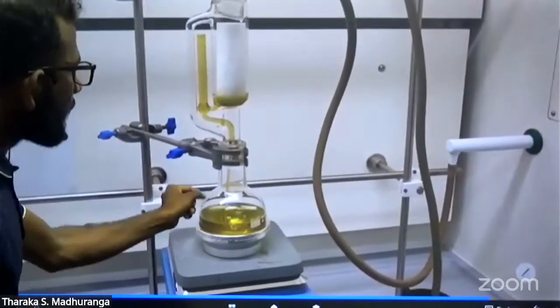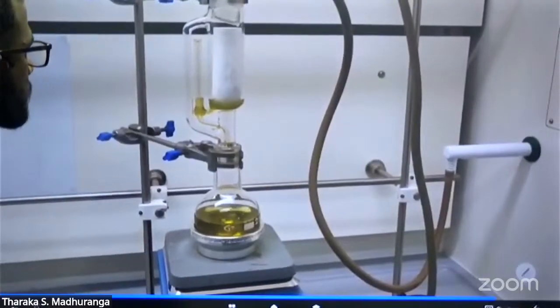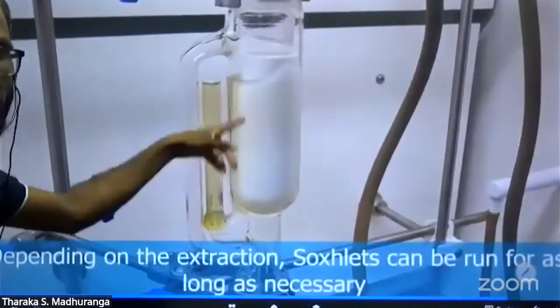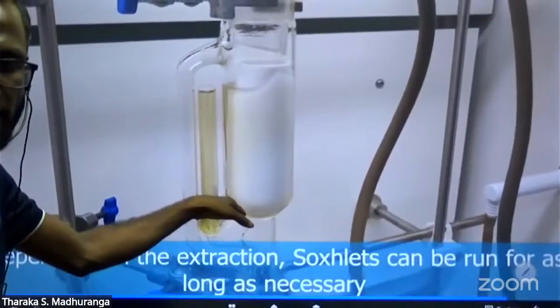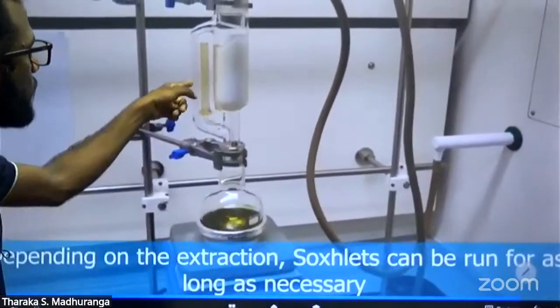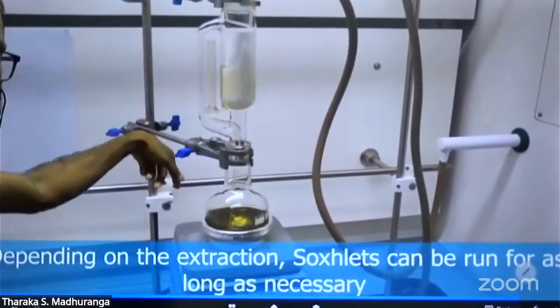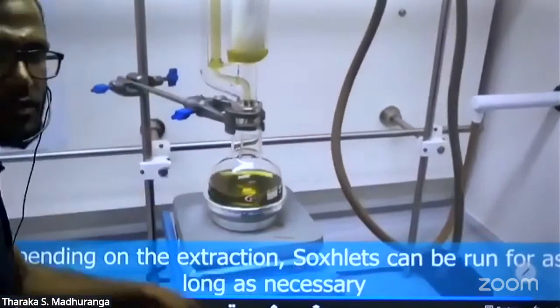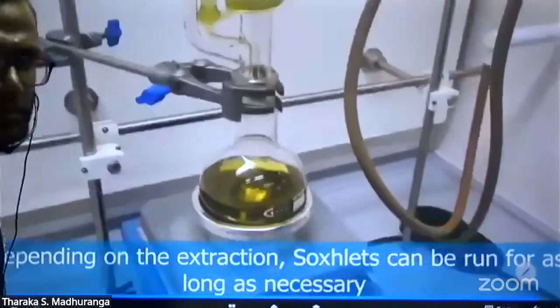It rapidly comes to the solvent chamber. So siphon, then again it starts to fill. All solvent in the chamber comes to the solvent chamber, from the above chamber to the solvent chamber. See again, that's the siphoning process. All solvents in the above chamber come to the solvent chamber rapidly.